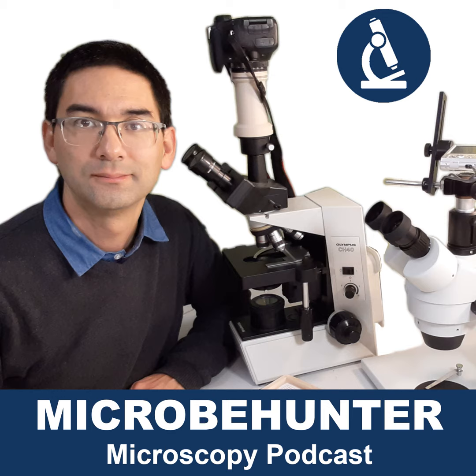But especially beginners often ask me, okay, I want to see, I don't know, a cell, let's say a plant cell. Can I see that with this particular microscope? And the answer is, I don't even have to look at the microscope. I can already tell you right in advance, yes, okay? Because cells are already quite large anyway. Most cells, except bacteria, most eukaryotic cells are quite large, and you can already see them quite well, at least most of them, even at surprisingly low magnifications.